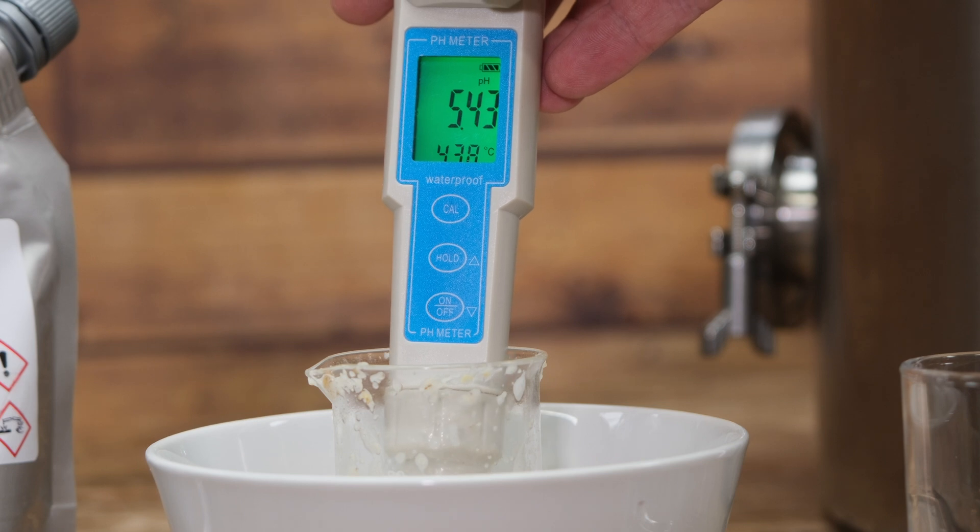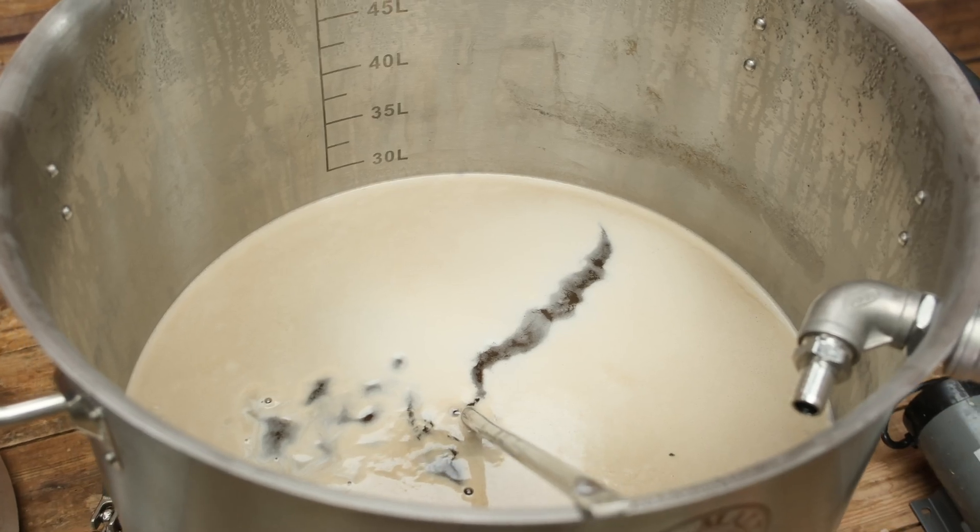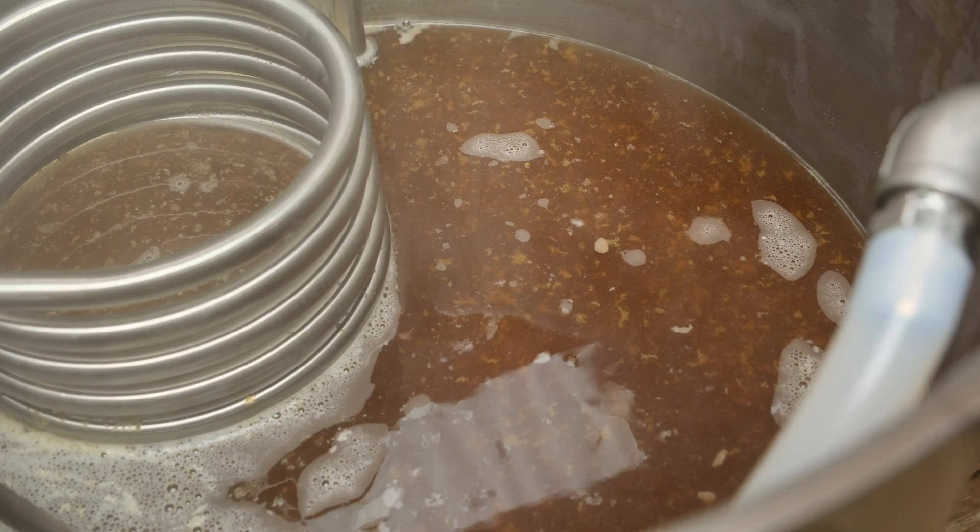As you can see, we've hit ours at 5.4. That's how we use a pH meter and calibrate it during the brewing process. You can use these at various different parts of the brewing process, but I would strongly encourage you first and foremost to focus on nailing your mash pH. If you can understand the pH going on in your mash, it will pay dividends all the way through the rest of the brewing process.